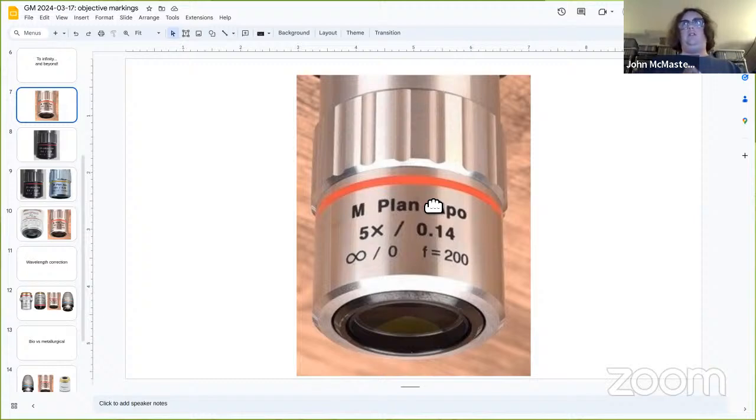And this is directly comparable in cameras to, I always mix up these two numbers, I think it's the F number of the lens. So basically, based on how much light the objective can collect, the more light, the higher the resolution. But at the same time, it'll also have a smaller working distance, and a lower depth of field typically.